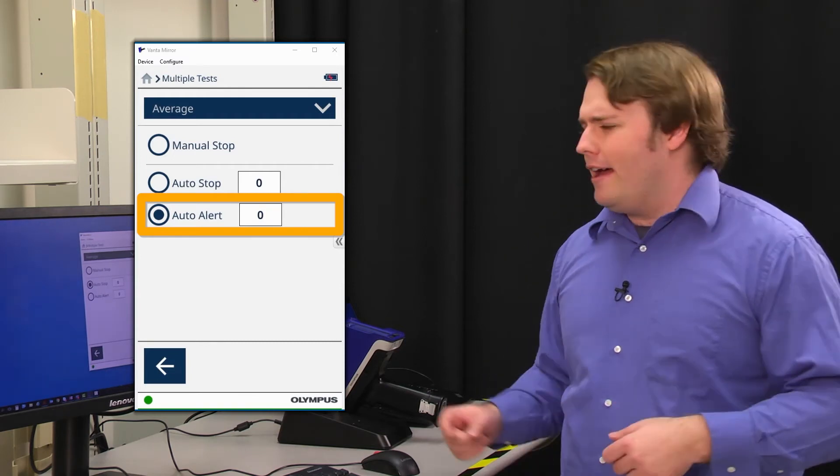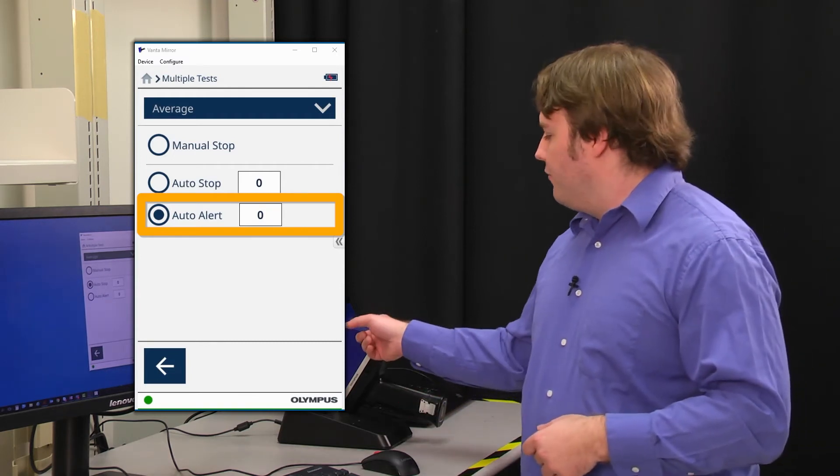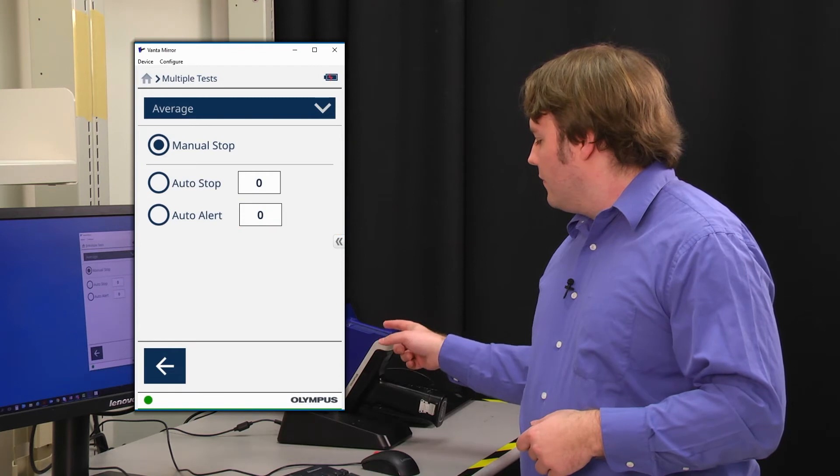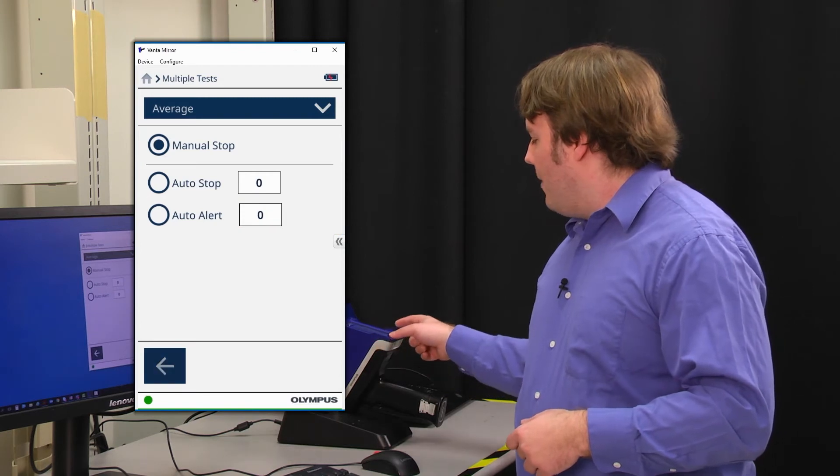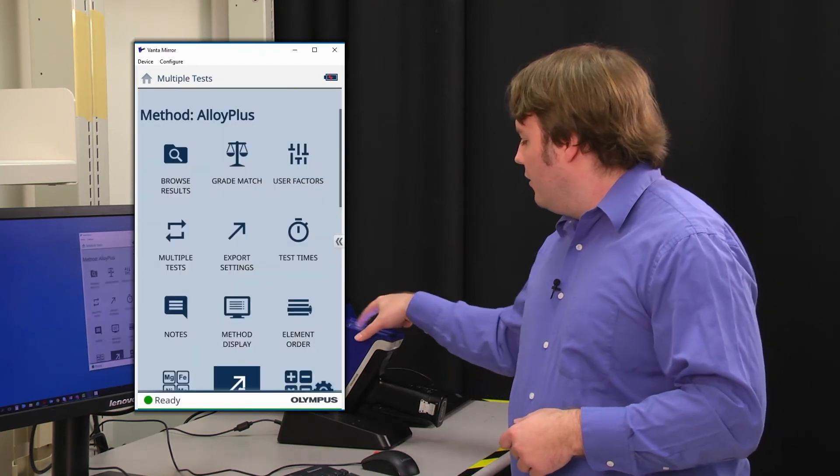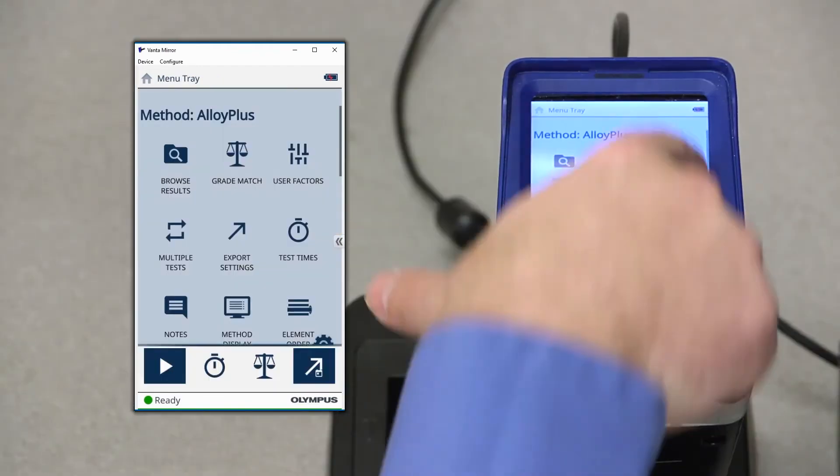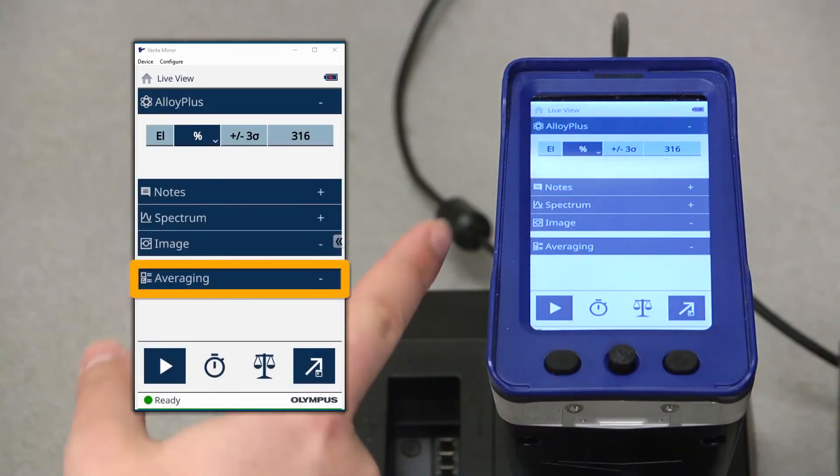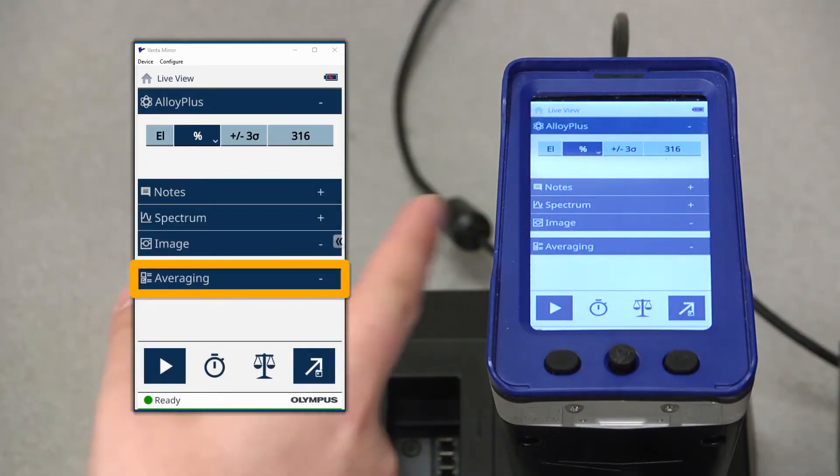For now, let's select the option for manual stop. If we go back to the screen here, we should now see an option for averaging in the bottom of the screen there.